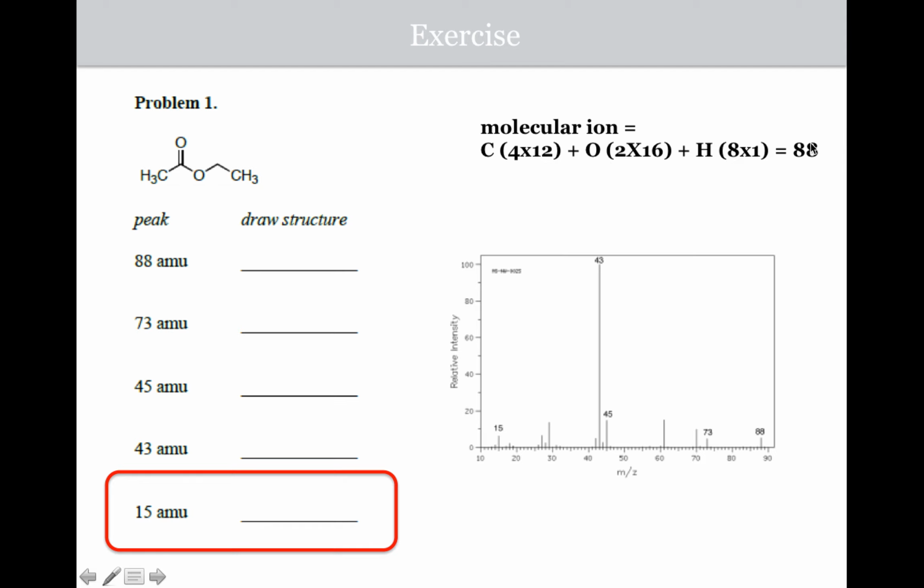That makes 88. So in the mass spectrum, we see a peak at 88, so that's a good sign. The first peak is the molecular ion peak, the whole molecule with a positive charge, because it lost an electron without losing its mass. It's also important because all the fragments detected should be positively charged. So draw a positive charge all the time, please.